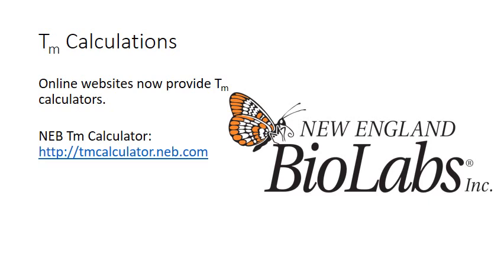This is just a calculator. Just plug in what your primer sequences are. You type in your forward primer, then you type in your reverse primer, and boom, it gives you your calculated annealing temperature for your PCR reaction. There we go again.